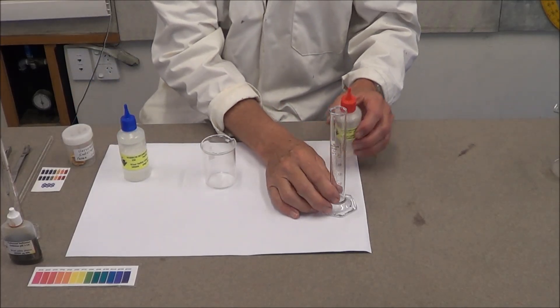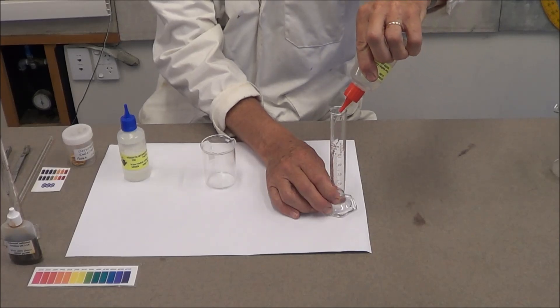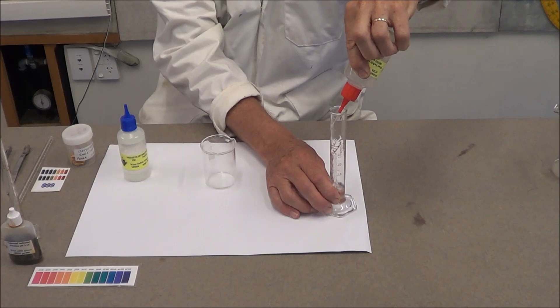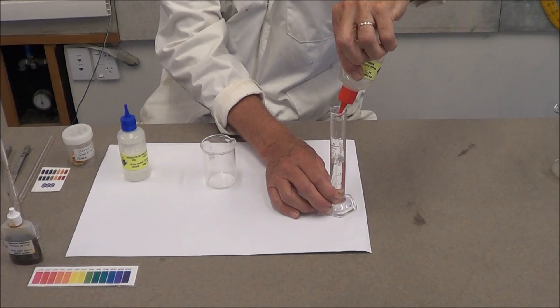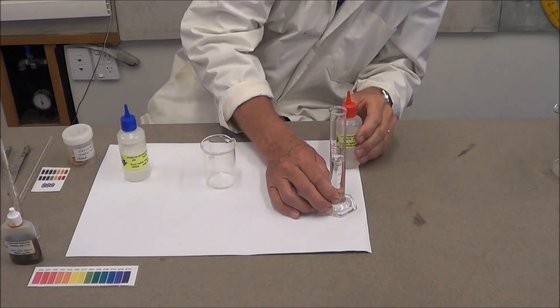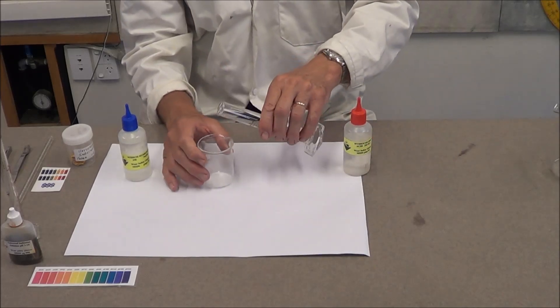First, measure 20 mL of 2 moles per litre hydrochloric acid, ensuring that the meniscus is sitting on the 20 mL mark. Pour this into your beaker.